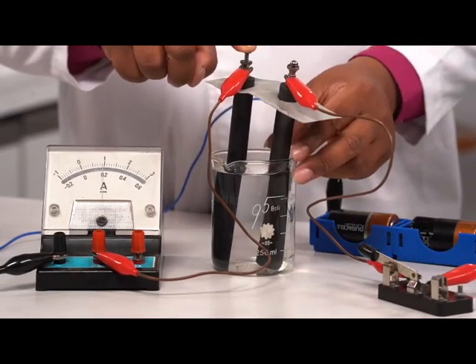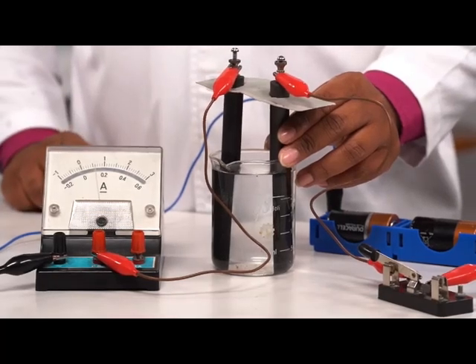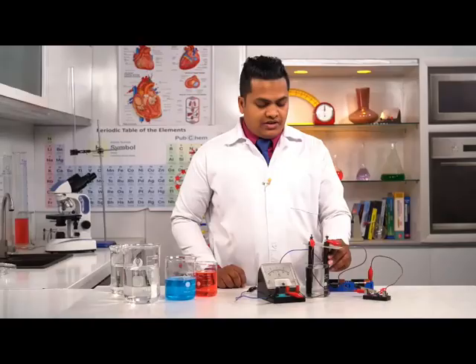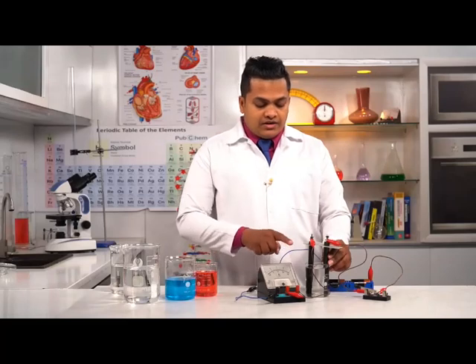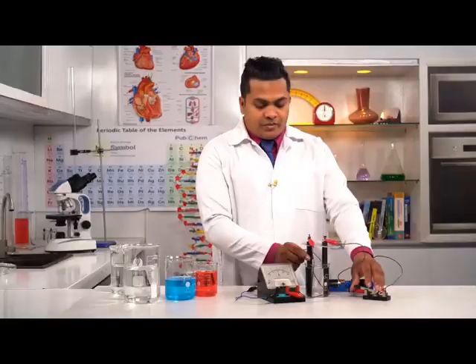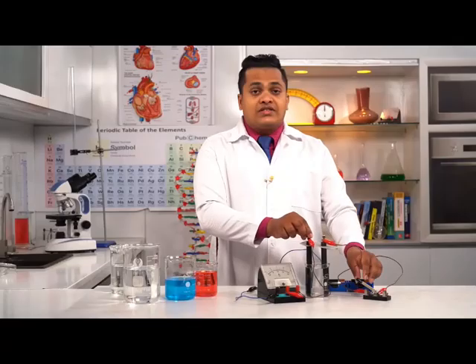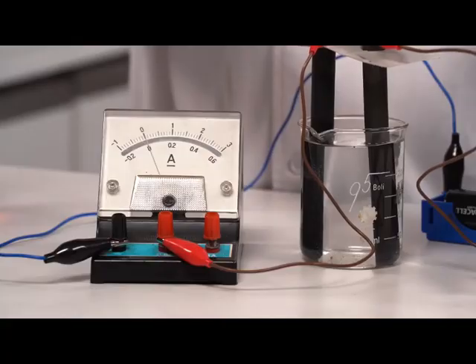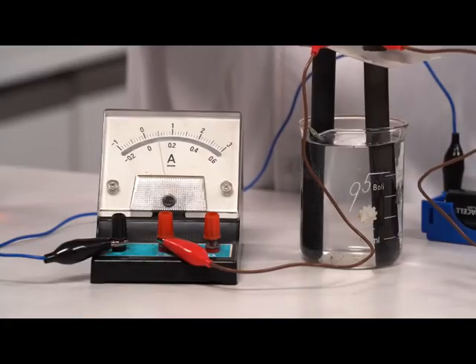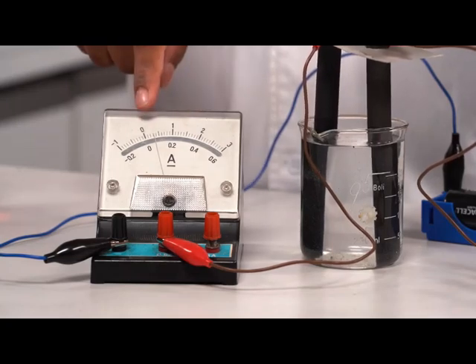As you can see, once again, my dear children, there is a deflection in the ammeter. There's a clear deflection in the ammeter. That means the salt solution over here also conducts electricity. When I turn off the switch, it comes back to the original position once again. Now I'm going to turn on the switch again. See, it's clear to us that there is a deflection in the ammeter.